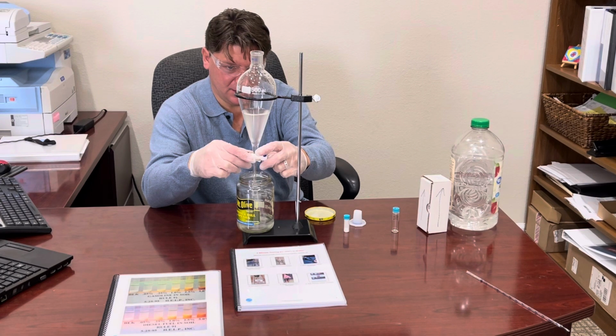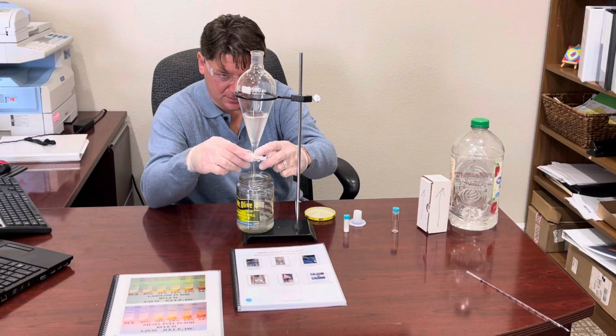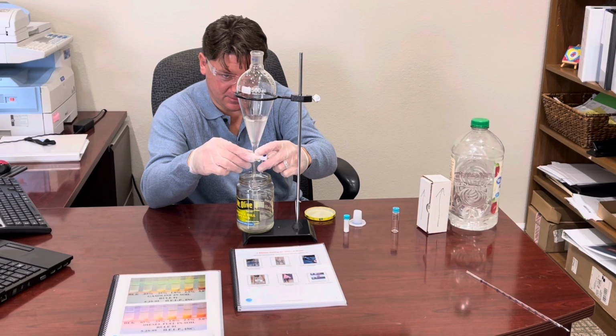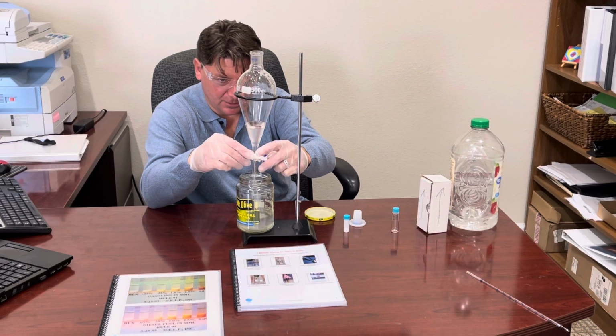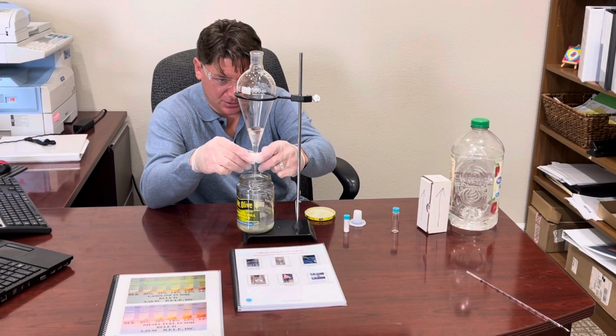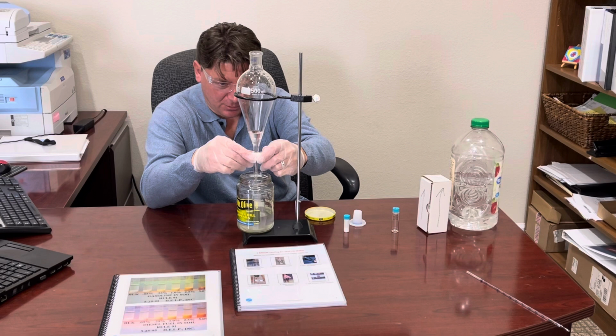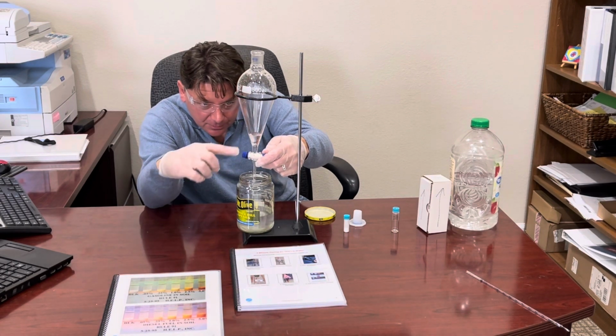As it starts coming down to that tapered part, we should start to see the solvent getting thicker as we release this water, so that's good. It makes it more prominent so it's easier to see. So we're getting rid of that water, and you can see it's getting thicker and thicker because of the tapered portion.